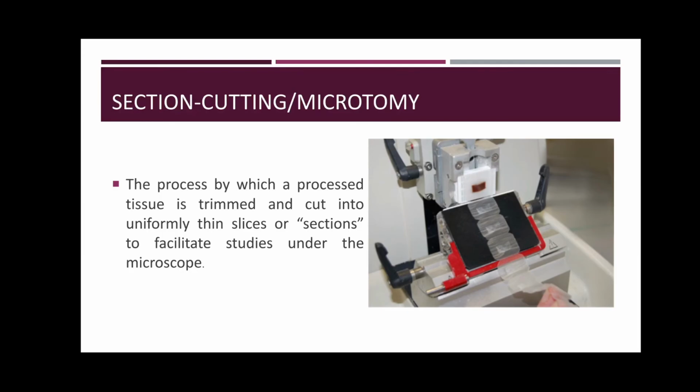The basic instrument used is a microtome that is capable of cutting a section at a predetermined thickness around 4 to 6 microns. So you write this down, please. 4 to 6 microns with a steel knife or a blade.